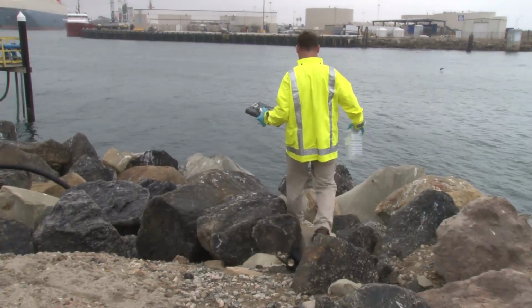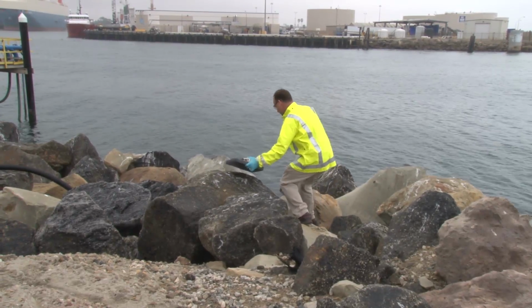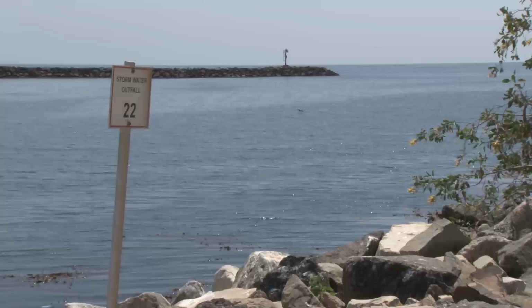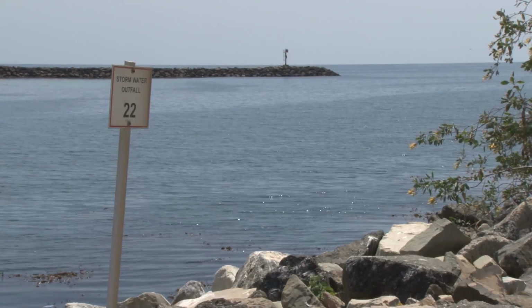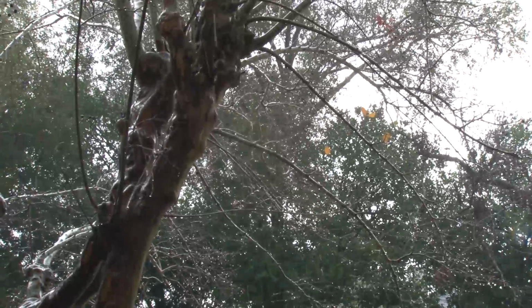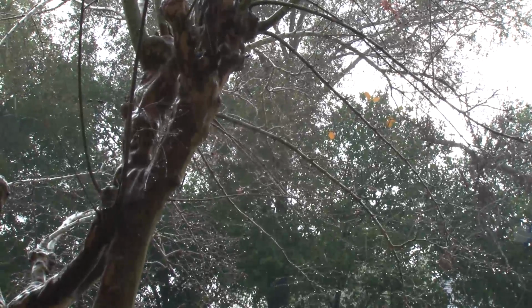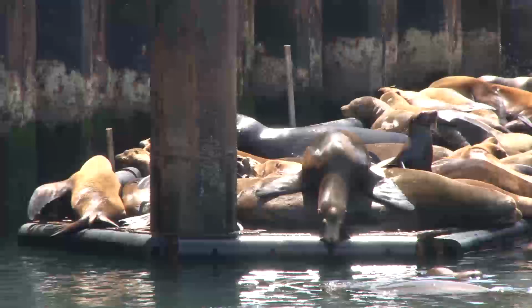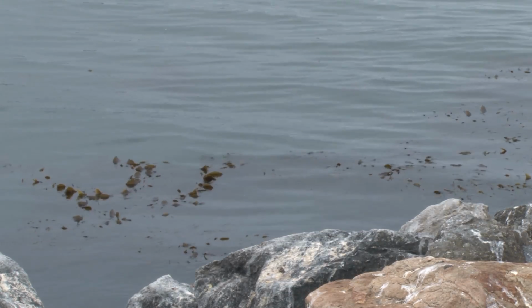Before proceeding with the details of water sampling collection, realize that there are hazards involved in this process. You must always make safety your number one priority. There are both general and special hazards to be considered during water sampling operations. The general hazards relate to exposure to the elements, such as rain, lightning, sleet, snow, and wind. You may also be exposed to animals and falls from slipping on ice or wet ground. The potential also exists for exposure to chemicals in the stormwater.